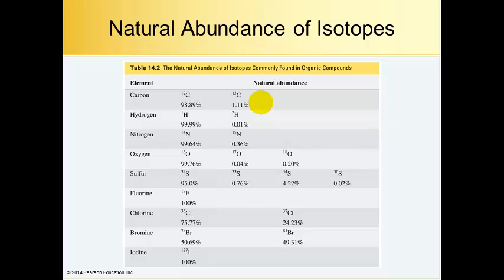So whenever we see a peak, we're going to see a little tiny M+1 peak, indicating the additional neutron mass from the isotope. With hydrogen, it's a very, very small percentage, so we don't necessarily see that, although somebody who does mass spectrometry for a living uses the natural abundance of hydrogen, deuterium, in their calculations.